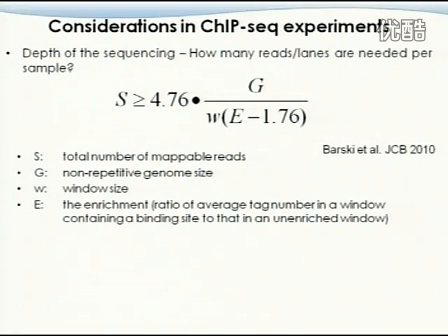If you think of it as 2, that is a pretty greedy way of looking at it, right? If there's no binding, you get 100 reads. With binding, you get 200 reads, and that is doubling it.